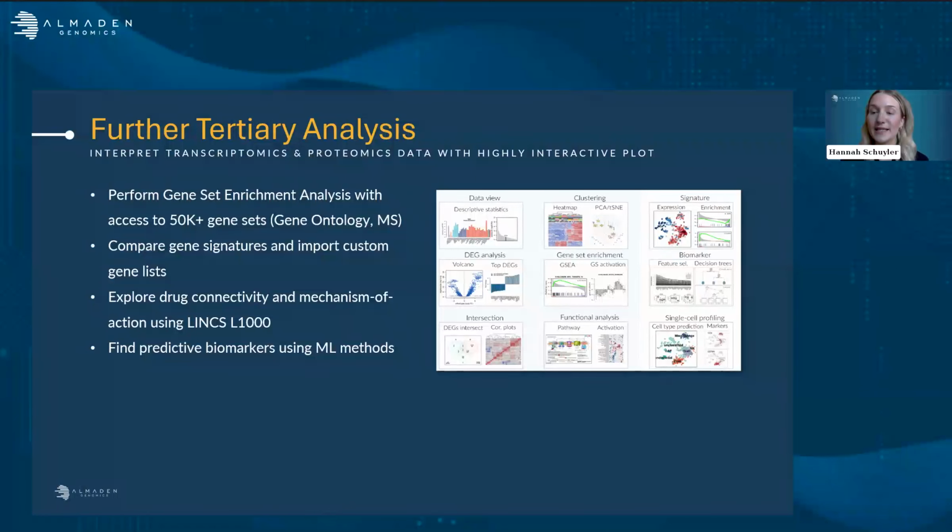Before I pass it over to Mark, I'd like to poll the audience and get a better understanding of where you are with your RNA-seq data. In just a second, you should see a poll pop up on your screen. The question is, when do you anticipate you'll be analyzing RNA-seq data? Right now, within the next 3 months, within the next 6 months, within the next year, or I don't need to process any data, I'm just here to learn.